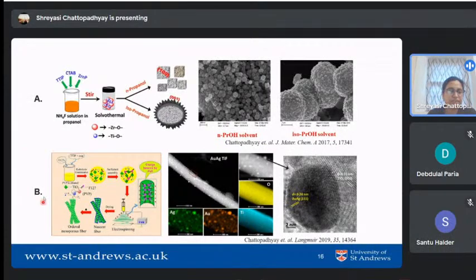For example B, we were trying to make nanofibers that have gold-silver nanoparticles forming an alloy. How do we know it's making an alloy, or it's just making silver nanoparticles and gold nanoparticles separately? For that reason, we do EDS mapping, elemental mapping, to see how the elements are distributed all over the structure.